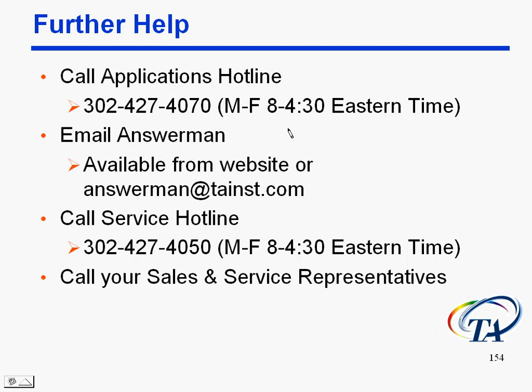Now, sometimes I realize that you've got a problem with your instrument or a problem running a sample, and you may not know whether it's a service-related problem or an applications-related problem. Please call one of us, and we'll direct you to the right person. We'd love to have you call, and either we help you or we pass you on to service or vice versa, rather than have you be frustrated and not get the data that you need out of it. And then your sales and service representatives are also good sources of information.